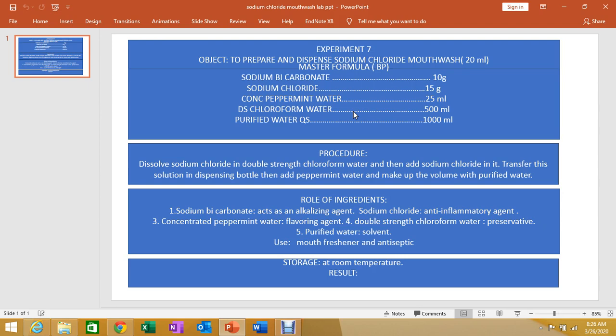The ingredients in sodium chloride mouthwash are: sodium bicarbonate, used in a quantity of 10 grams; sodium chloride, used in a quantity of 15 grams; concentrated peppermint water; double strength chloroform water; and purified water. This is the master formula, but we will use 20 ml or 30 ml for the final preparation.